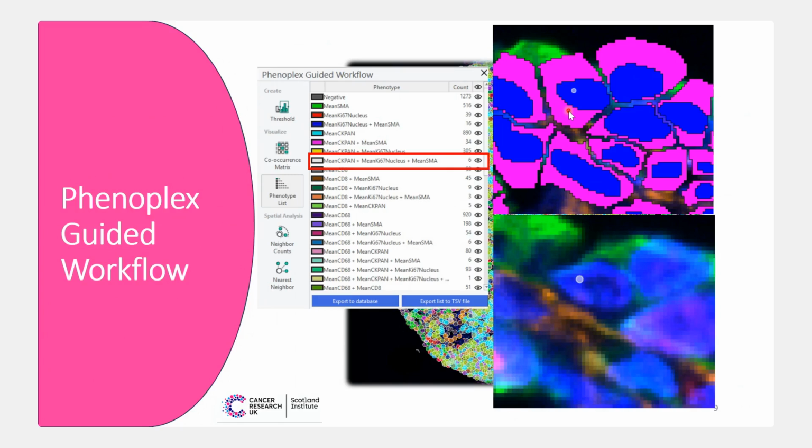Other labs we know use cocktails of antibodies to generate membrane markers, and that can be used for the cell boundary, but for us, especially for our lower plex assays, this takes up precious space in our multiplexes. So we basically want a better way that we can phenotype without segmenting the cells as accurately as possible.